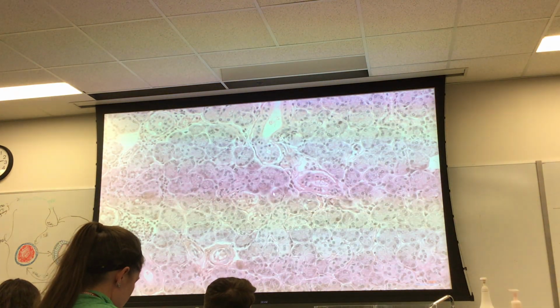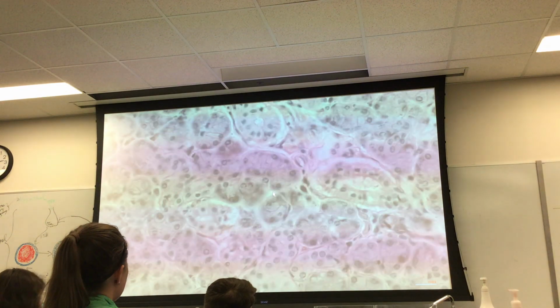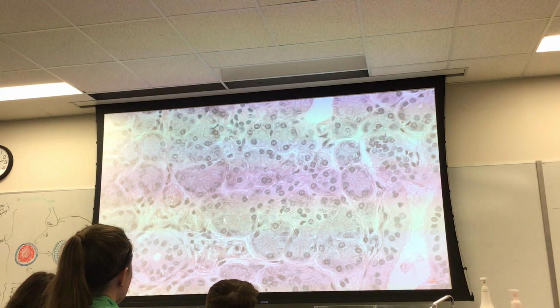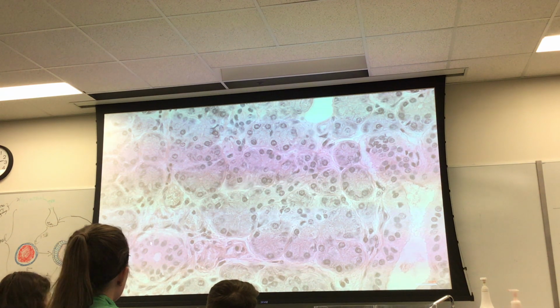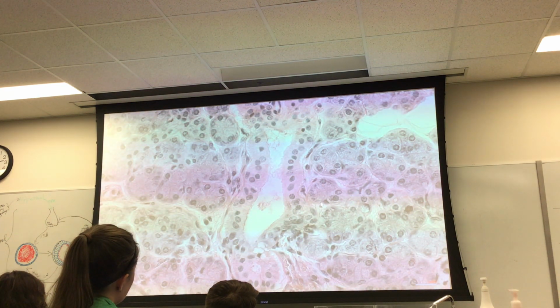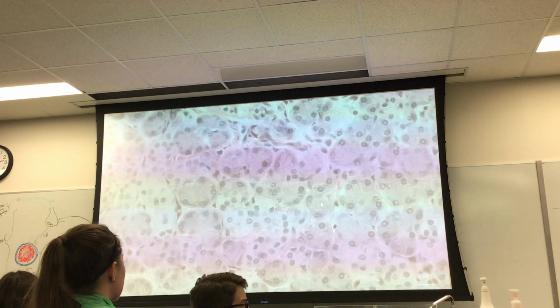Let me just show you one more thing, or actually two more things. Take a look at this. Now this is pretty low magnification, so here's a little higher. And in fact, here's a little higher. As you look around, you're going to say, well, this looks a lot like an exocrine gland to me. And why? Because these are serous acini, I know that, whereas this is a duct. And as you look around, you're going to say, well, here's the duct in longitudinal section right here, and you're going to learn how there are different names of ducts and so forth.